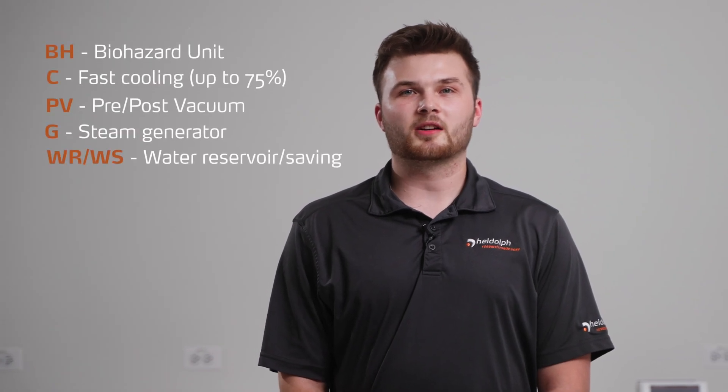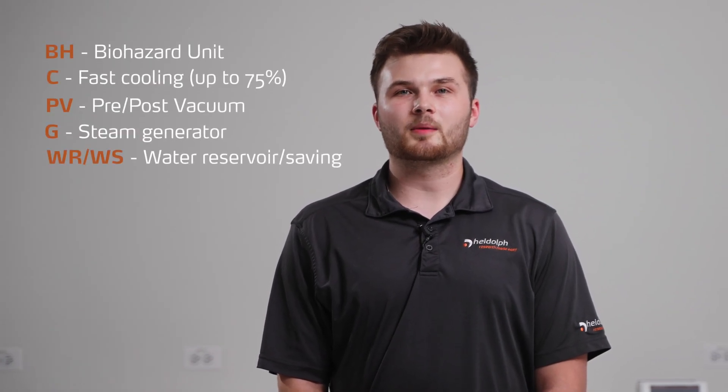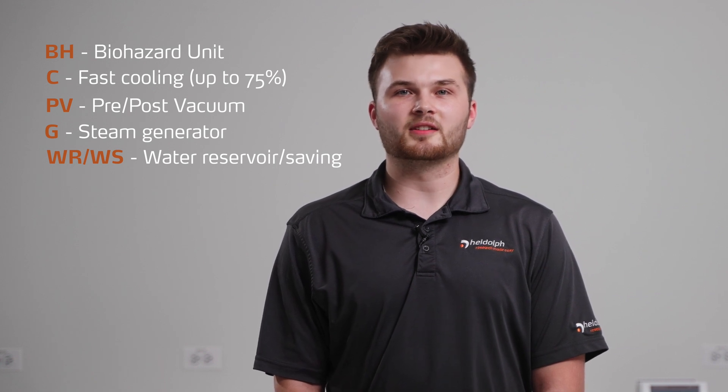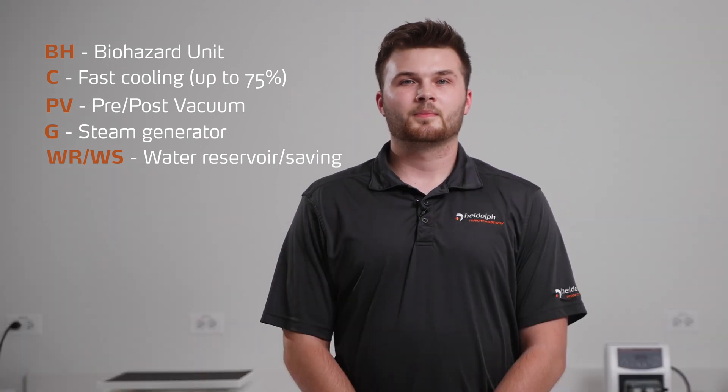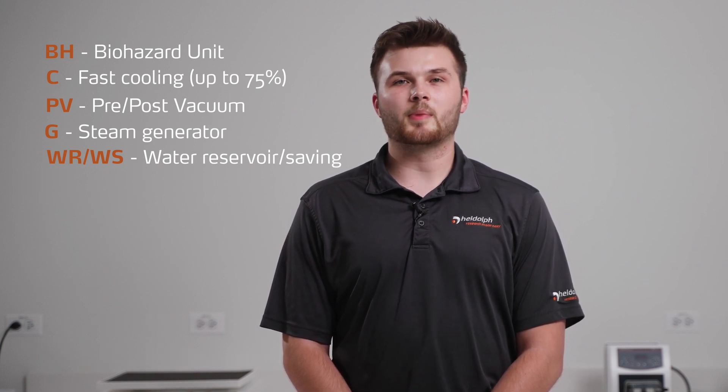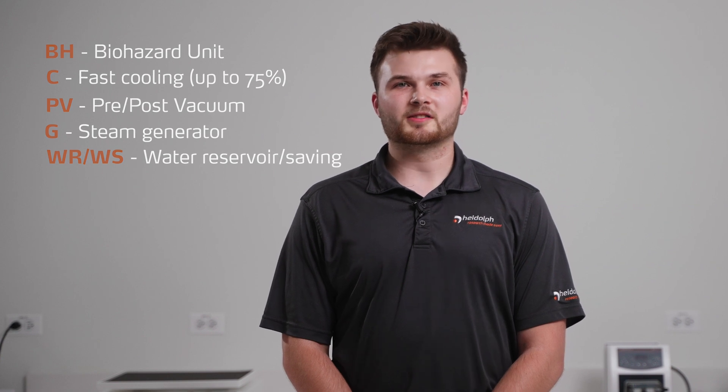LabLine autoclaves come as horizontal benchtop units, vertical top-loading units, and freestanding units up to 160 liters that can easily fit in your lab. These models can be equipped with a steam generator, a vacuum pump, cooling coils, a biohazard filter, and water-saving features.